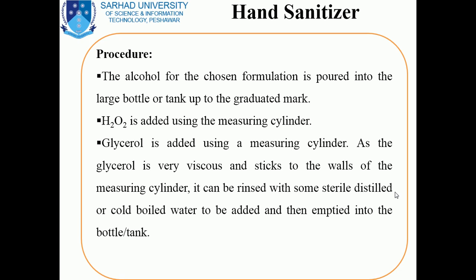as the glycerol is very viscous and sticks to the walls of the measuring cylinder. So in this case, it can be rinsed with some sterile distilled or cold boiled water, and then emptied into the final container or bottle or tank.